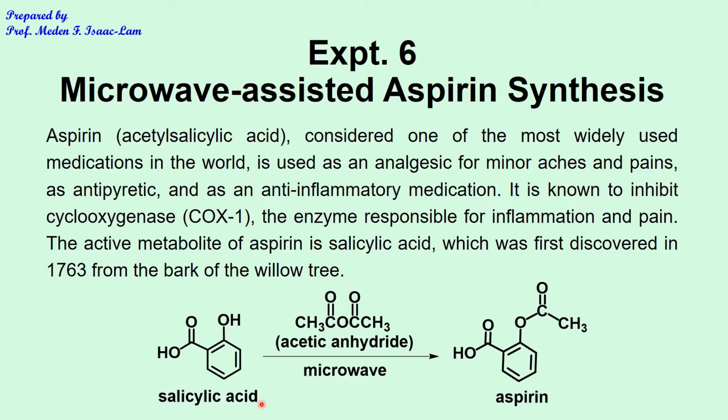This experiment is also an application of green chemistry because there is no solvent. Salicylic acid and acetic anhydride mixed together after microwaving produce the aspirin, no solvent. The ester formed in aspirin is called an acetyl group, thus the name acetylsalicylic acid for aspirin.